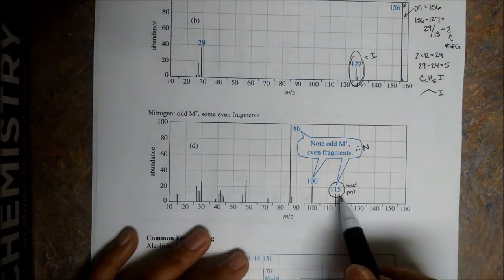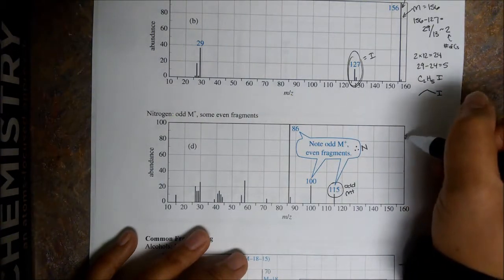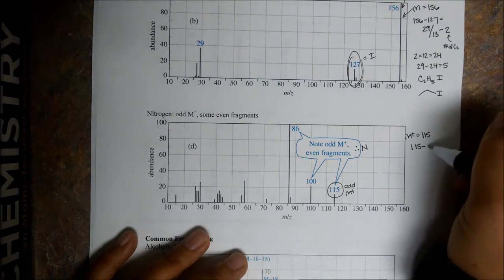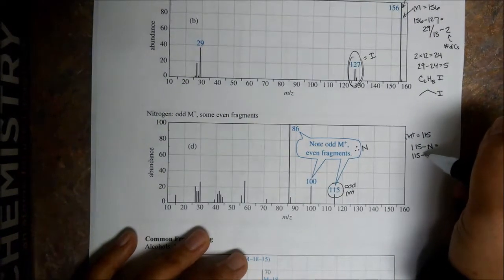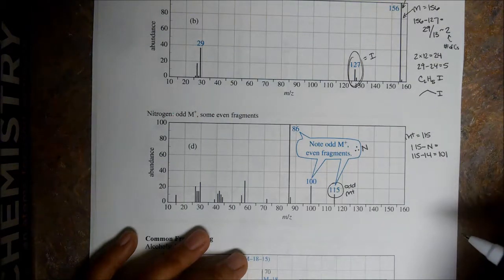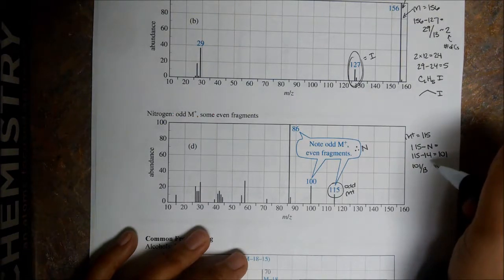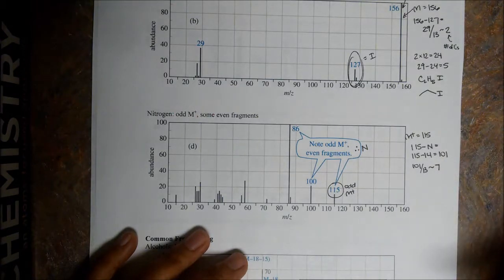Let's try to look at this structure. If our molecular ion equals 115, let's subtract our nitrogen: 115 minus 14, and we get 101. Let's use our rule of 13, and we get about 7.